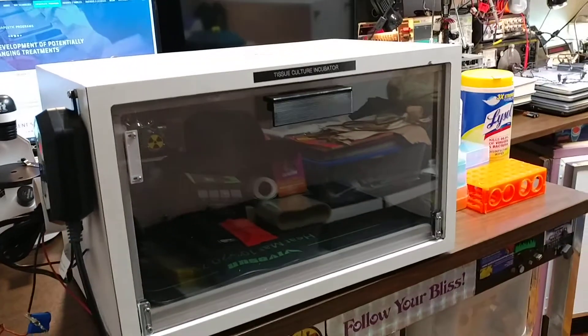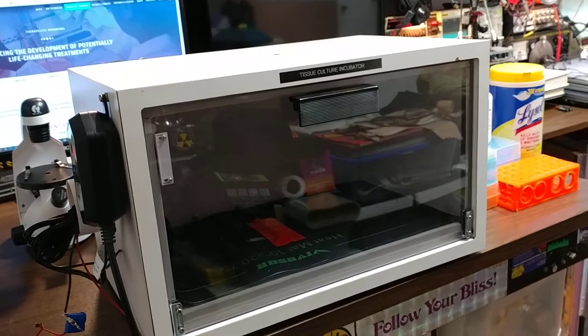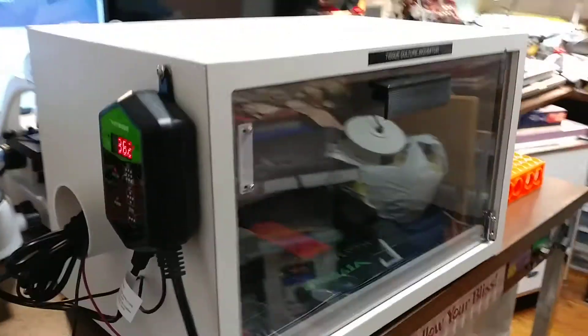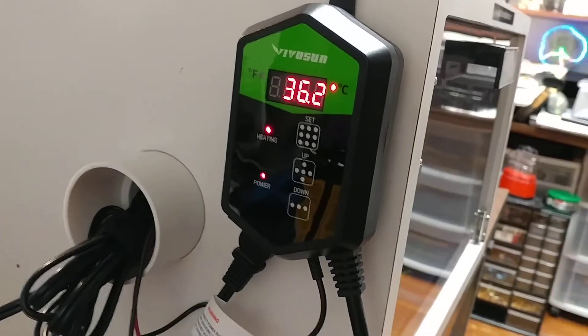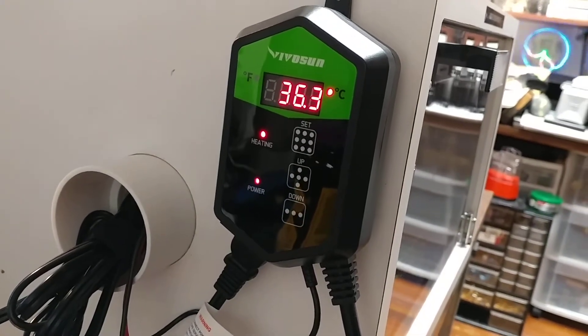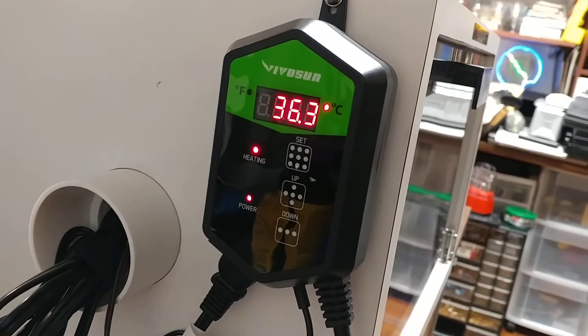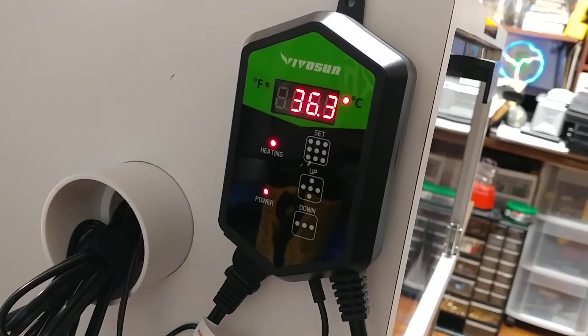That's it — that's the tissue culture incubator. It should work well. It seems to be staying within, when I set it for 37 degrees, it's been staying within 36.2 to about 37.3. It's been pretty stable.